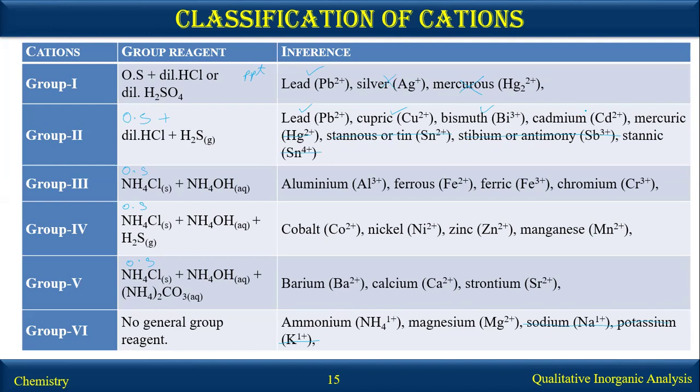But in a few colleges, cadmium is given, bismuth is also given, and copper and lead are very common. So it depends on your instructor whether he has kept these salts in the syllabus of his college or not, because it is up to your college.